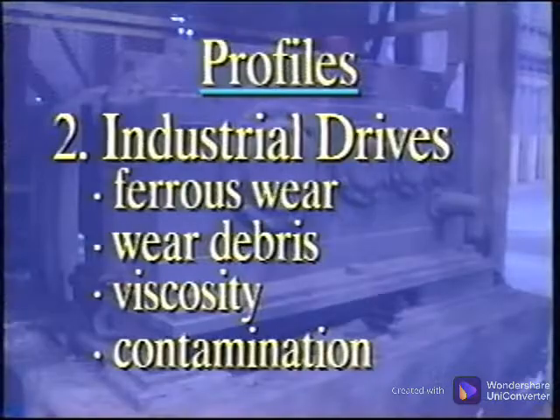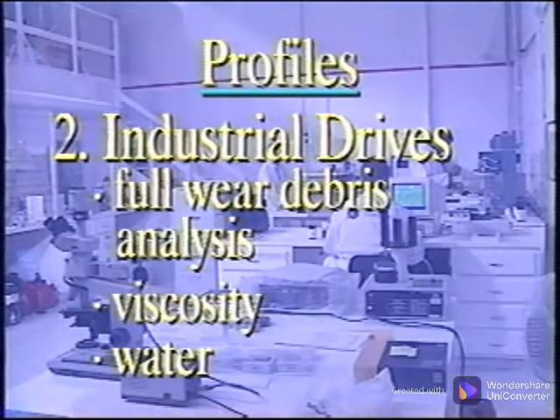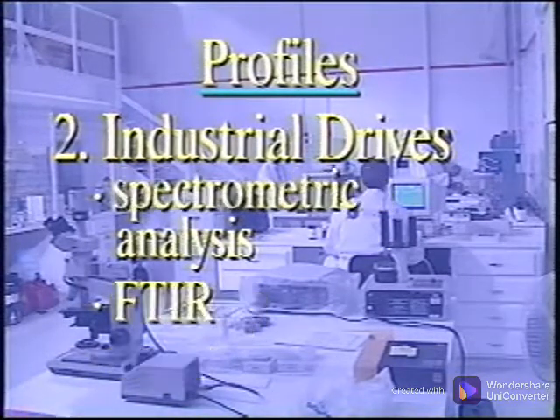The laboratory analysis should include spectrometric analysis to test for additives, viscosity index, FTIR to test for molecular degradation and water contamination. Industrial drives such as gearboxes, crushers, chippers, and stamping processes should be tested for ferrous wear and wear debris analysis, as well as checks for viscosity, water, and other contaminants. Off-site analysis should include a full wear debris analysis, viscosity, water contamination, spectrometric oil analysis for the additive condition, and the FTIR to determine degradation.